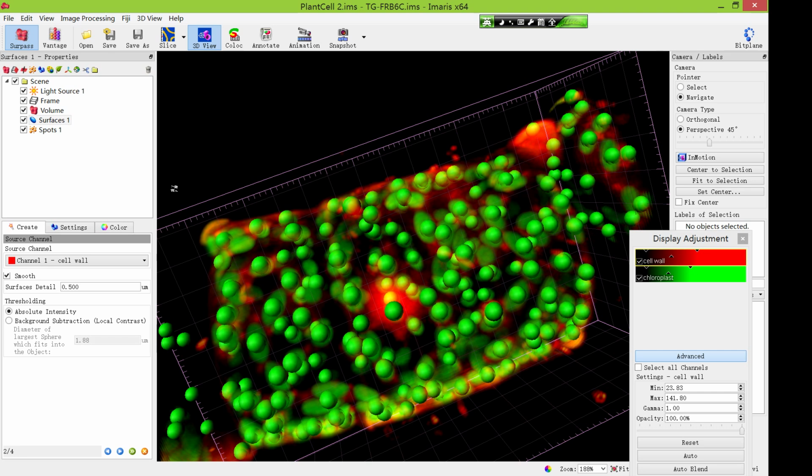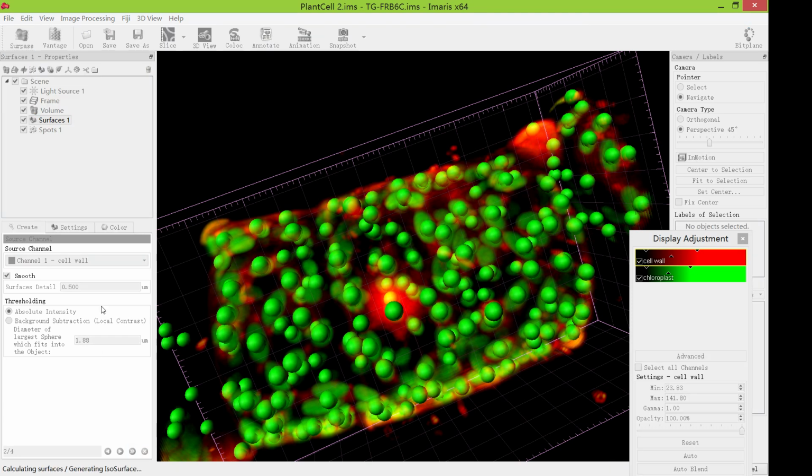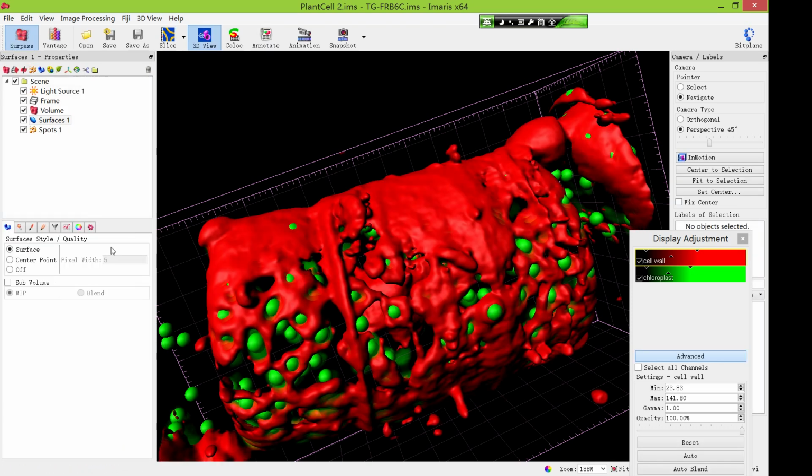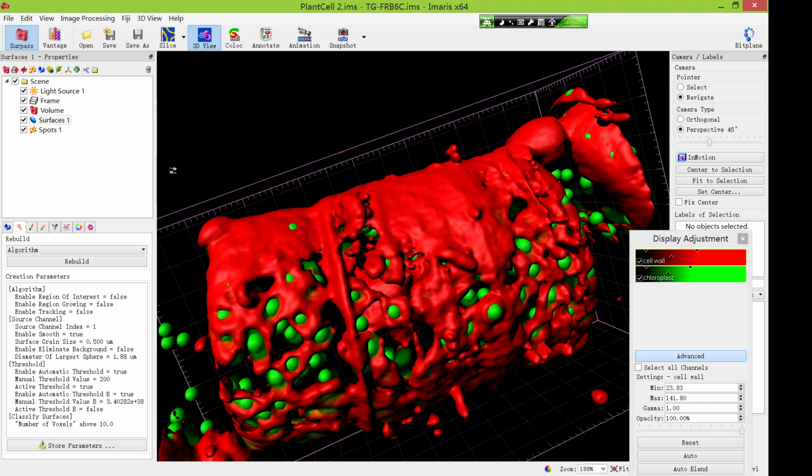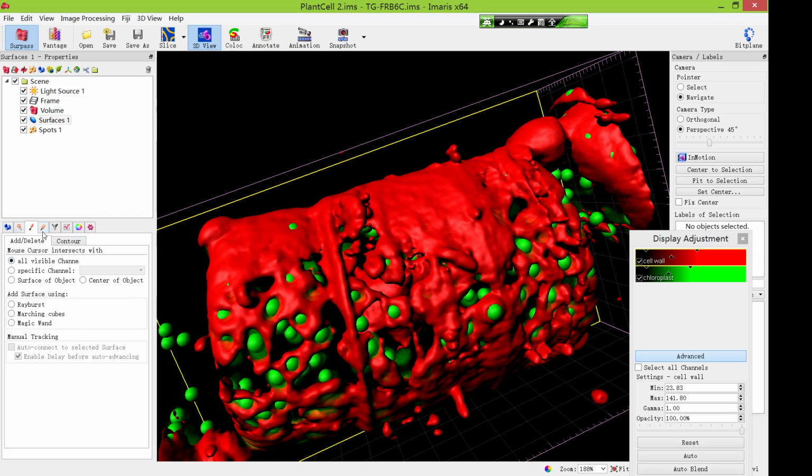and after that you save it as experiment 2. After all the process is done, you store parameters experiment 2 amyloid AMY antibody. Okay, so for the secondary experiment you can reuse. I think the threshold adjustment may be needed because there are variations between the images, and there may be more variations between your different clones. So that's why you need to manually adjust the threshold.